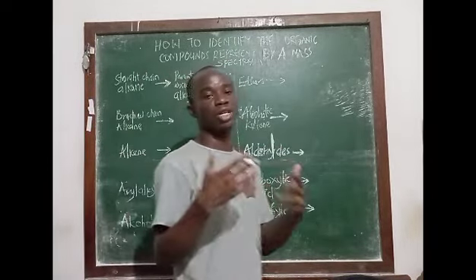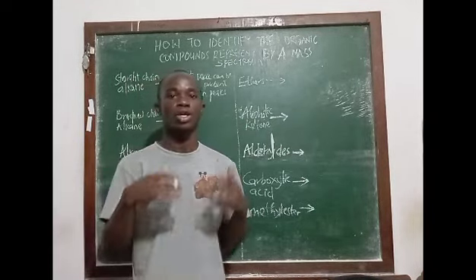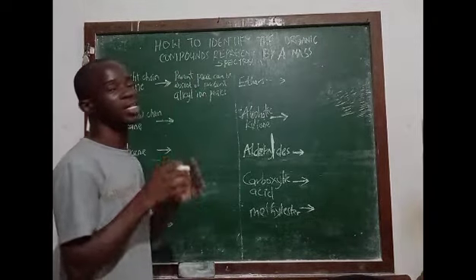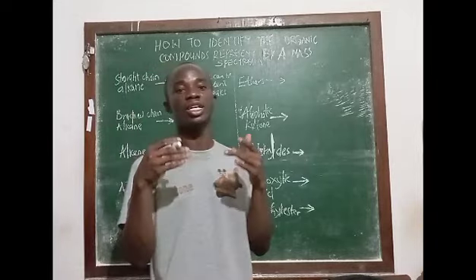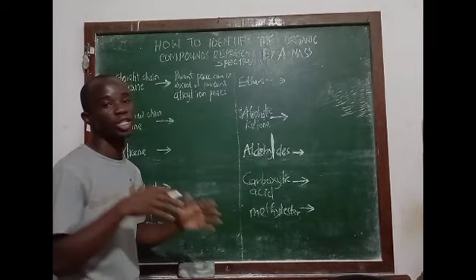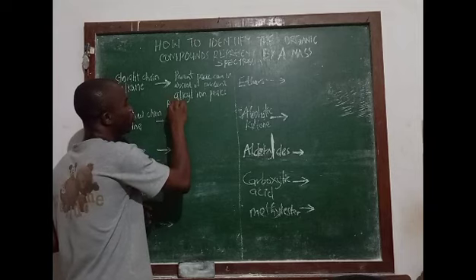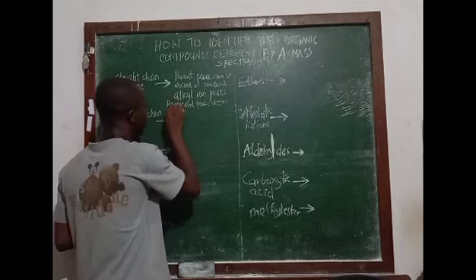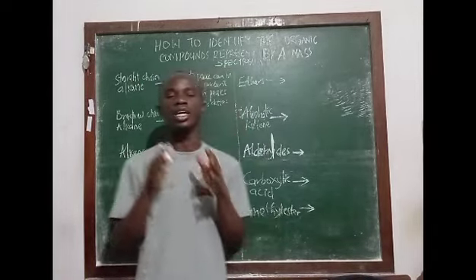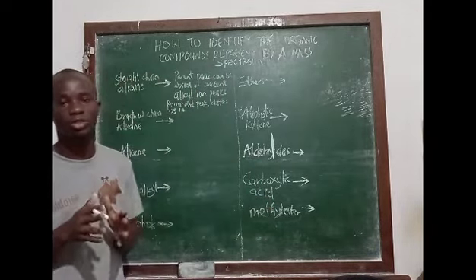So if you look at those mass to charge ratios I've mentioned for different alkyl ions, you will see that they differ by what? By 14. And that's another feature you can always see in a mass spectrum to know if a mass spectrum represents a straight chain alkane. That is, the prominent peaks will differ by 14. So the prominent peaks in a mass spectrum that represents a straight chain alkane will always differ by 14.